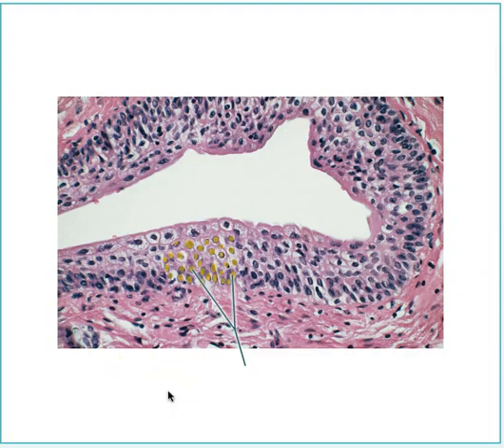Now you're identifying the highlighted structures and also the tissue type. The highlighted structures are definitely nuclei. And this tissue type is transitional epithelium. For bonus points, what is the name of this organ where you could find this? If you guessed urinary bladder, you are absolutely correct.